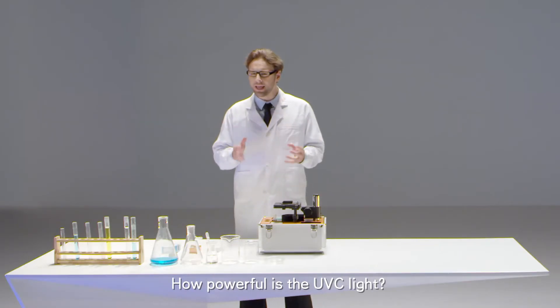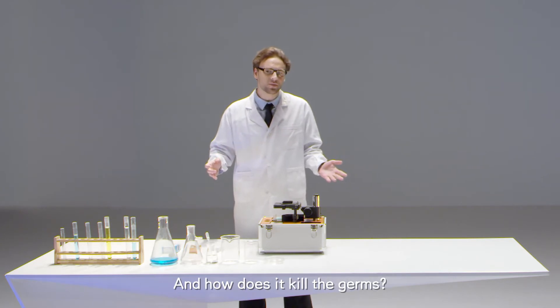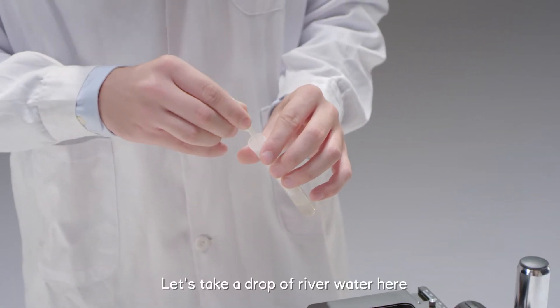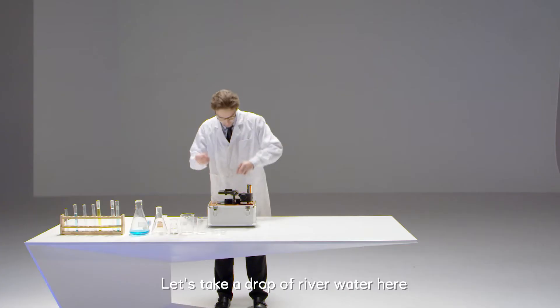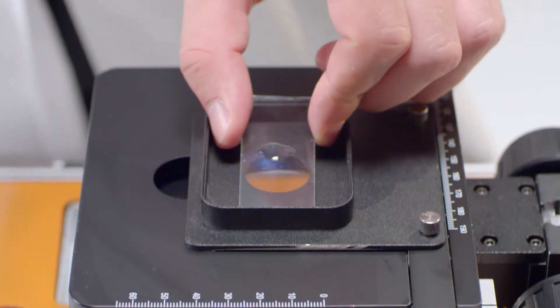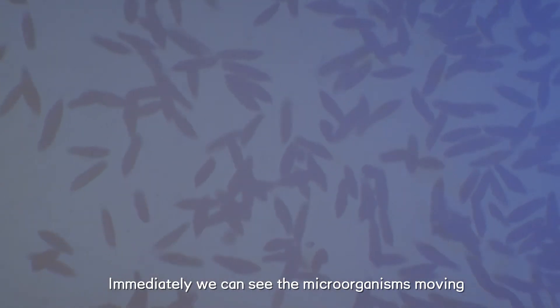How powerful is the UVC light and how does it kill the germs? Let's do an experiment and find out. Now let's take a drop of river water here. Immediately we can see the microorganisms moving.